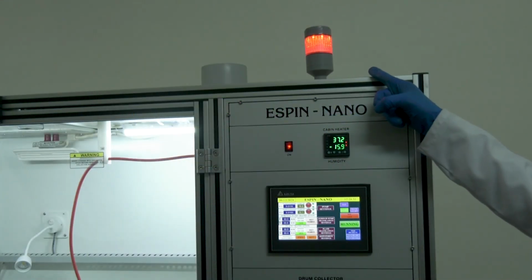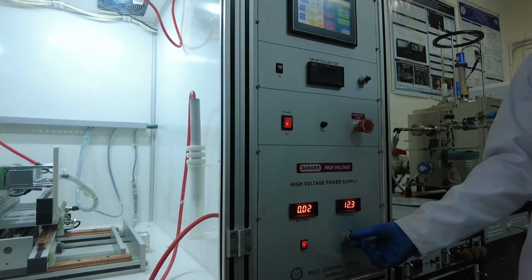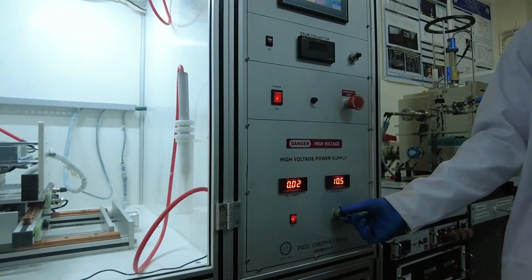Finally, we have the high voltage setup. Be cautious during this step. The red light indicates that the voltage is on. Adjust the voltage based on the polymer and the distance. Now we will begin the electrospinning process.